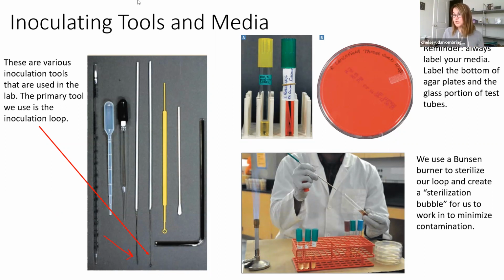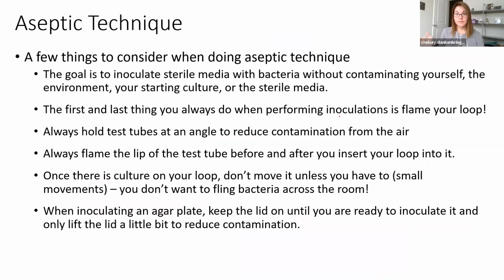And that's the only real issue with this picture that I have, is that they are inoculating that test tube pretty far away from the flame. So you really do want to, I normally keep my rack right in front of the flame. That way I'm working with a few inches separating my hand and the flame. So you do want to work within that sterilization bubble.